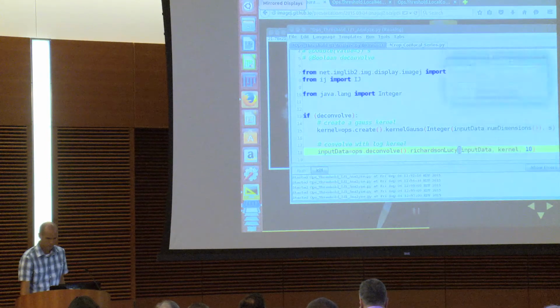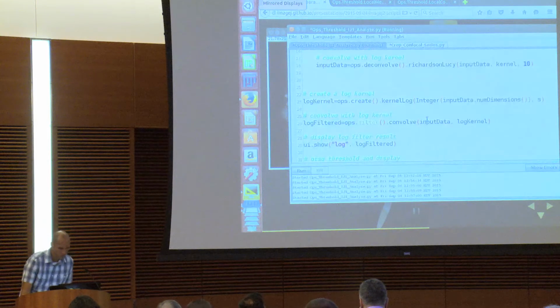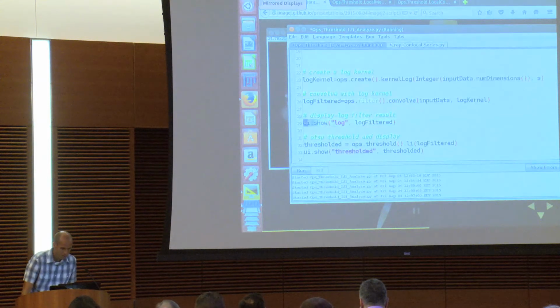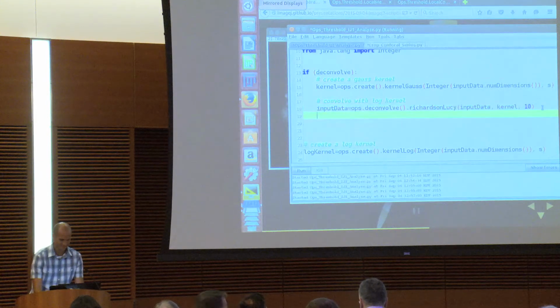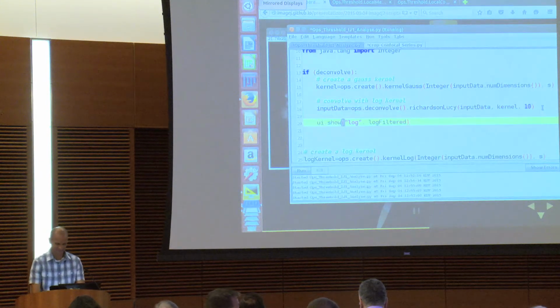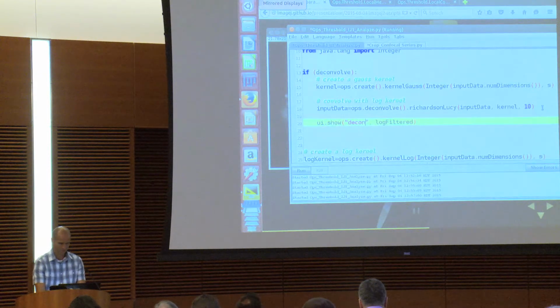I'm going to cancel this, because one other thing I should do here, just to make sure. Let's just show it here to see, make sure.